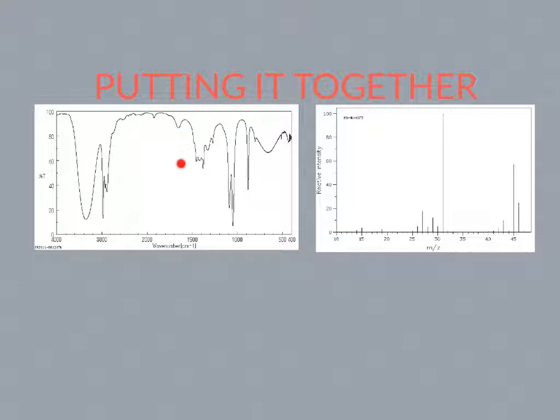Finally, we will go over to the 5th zone, which is carbon-to-carbon double bonds. Now, this looks more like a jumbled mess than anything. It's possible, but not probable, that we have those in our molecule. So remember, this part is the fingerprint zone, and we do not analyze this.